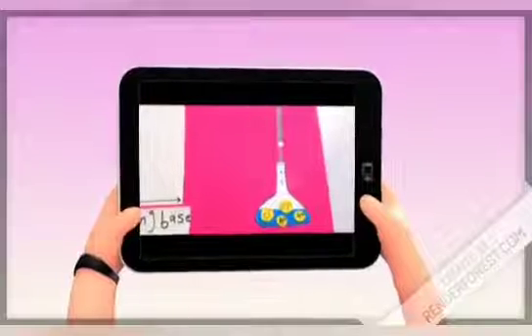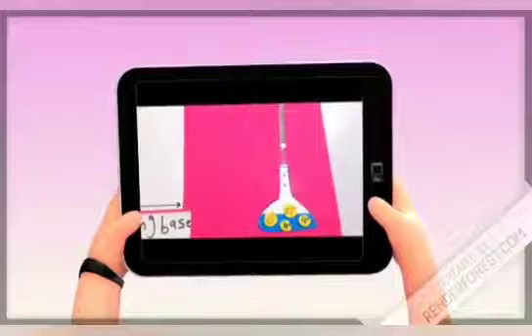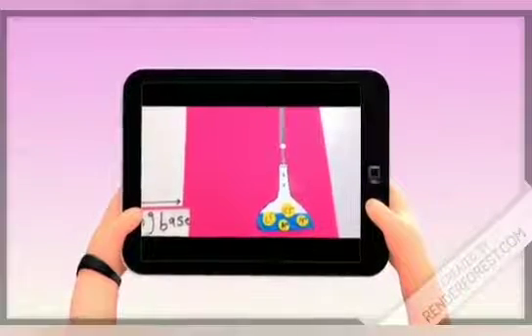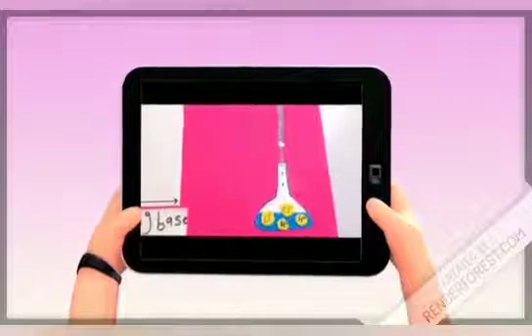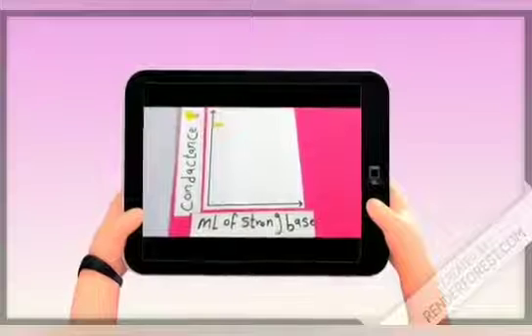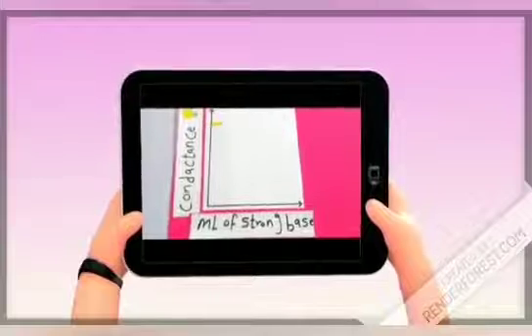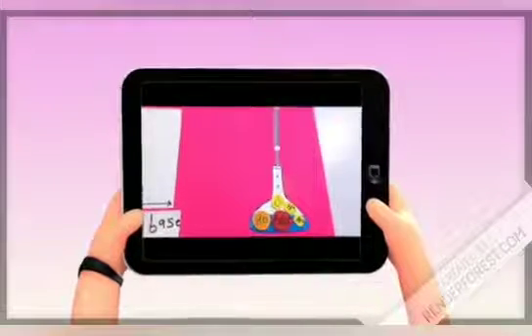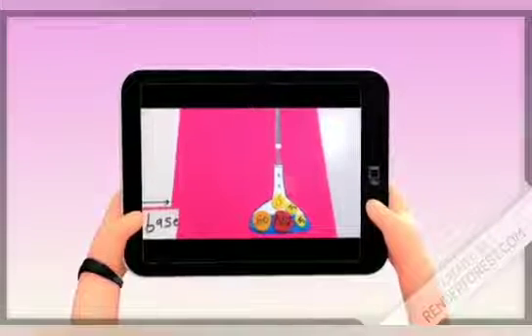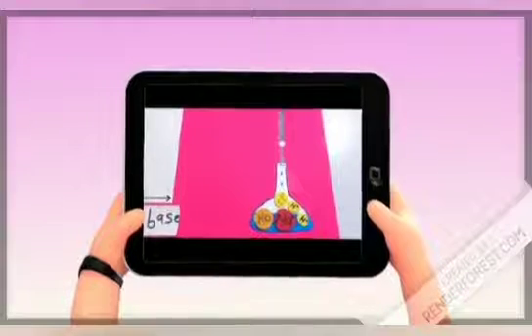Let's see the titration of strong acid and strong base. At the first, before we start the titration, the flask only contains hydrochloric acid, which is a strong acid, highly ionized, and so the conductance is high due to high ionization of hydrochloric acid to chloride ion and hydrogen ion, which is small in size. When we start the titration, we add sodium hydroxide, which is a strong base, highly ionized to sodium ion and hydroxide ion.